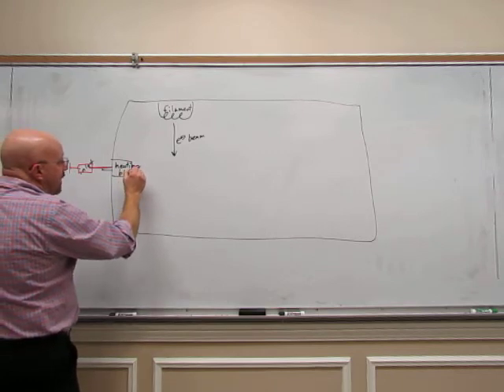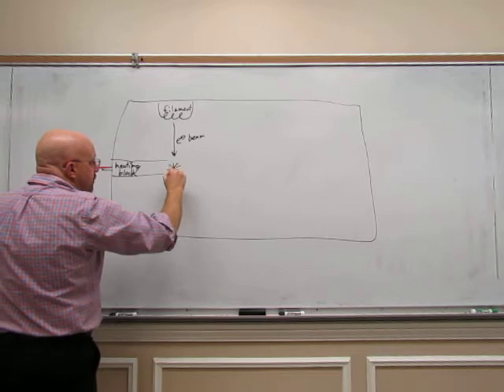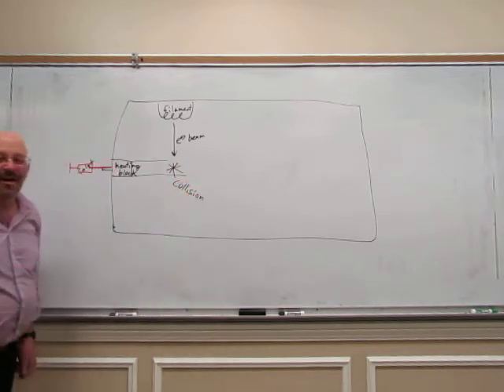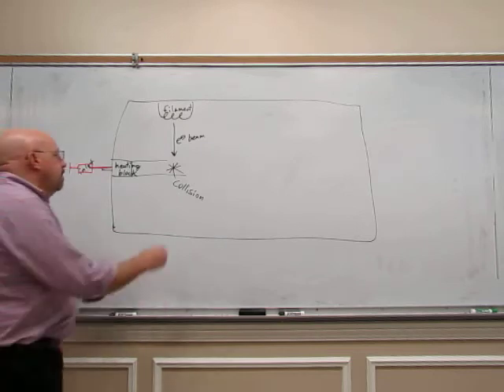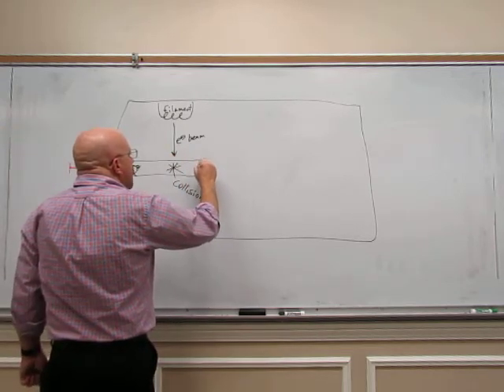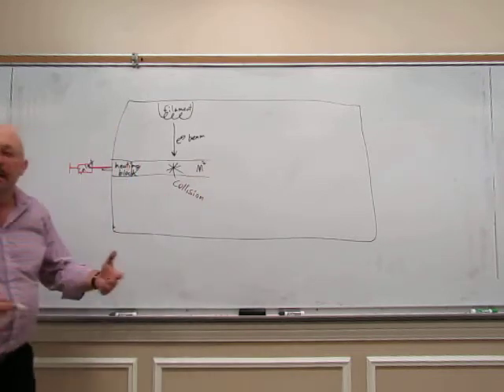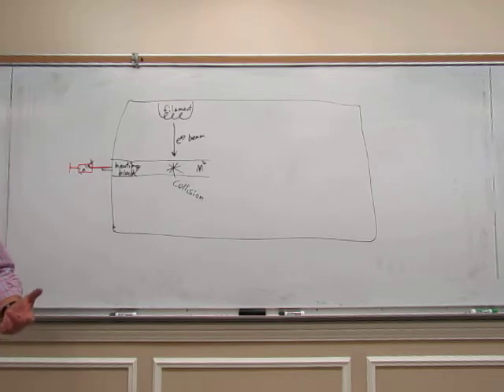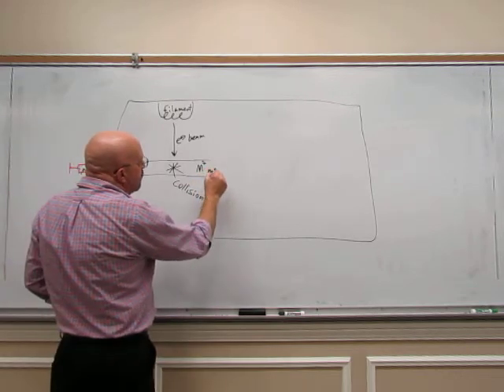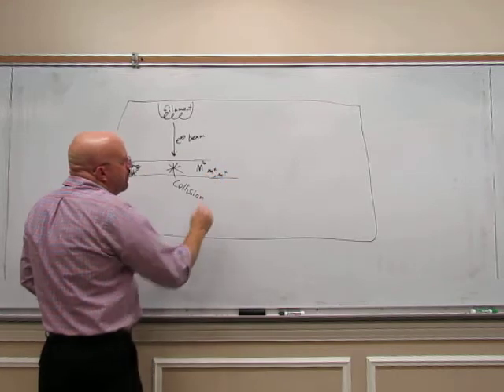Your molecule's in the gas phase, so it's coming through now, and we have our collision. So we knock an electron out of the molecule. So now it's floating along, and now it's a radical cation, or it may start fragmenting into those smaller pieces. We'll have some of those as well. So you may see just a cation or another radical cation fragment.